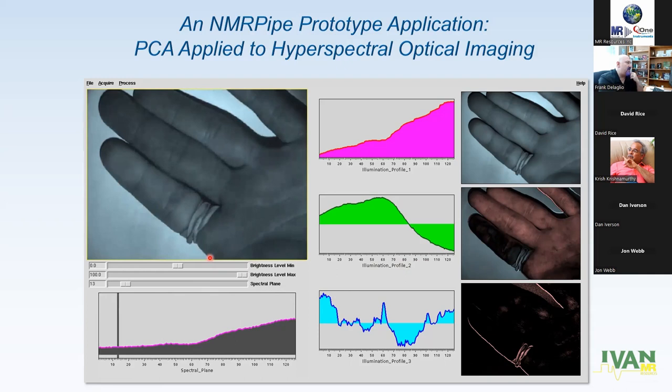So when we look at this particular second component image, we can see that that finger is darker because it's a different color. Very hard to tell that from any one of these grayscale images. But when we combine all the information using principal component analysis and display the result, we can get something interesting and clear. And so we segment the hand, the dark part, and the rubber band. Very nice.